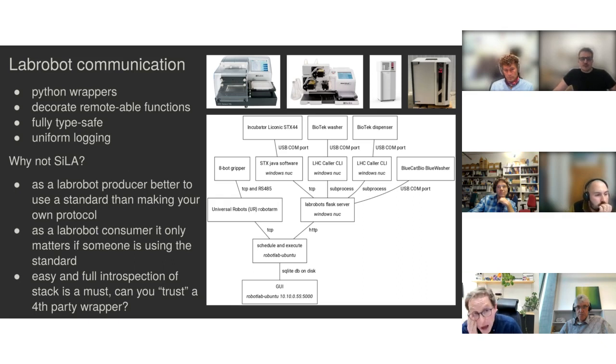Also, our developer team is quite small. It is just me, so I don't really need to care about someone else's preferences. But with a bigger team, it can of course be very beneficial to use something that more people know. So yeah, I'm not against SILA. It just hasn't been relevant for us yet. So that's what I can say.